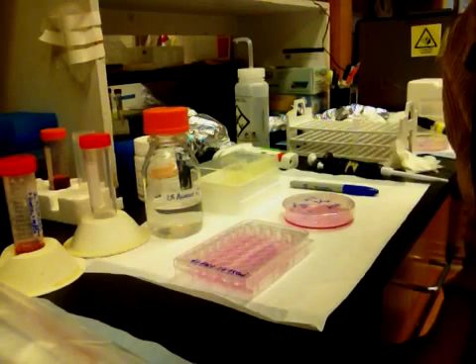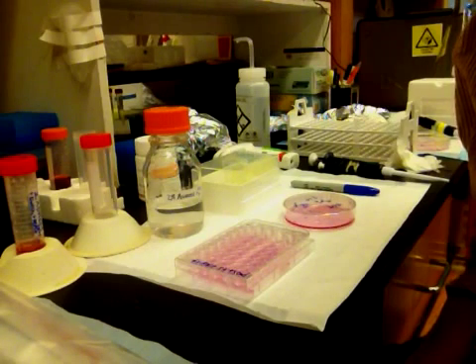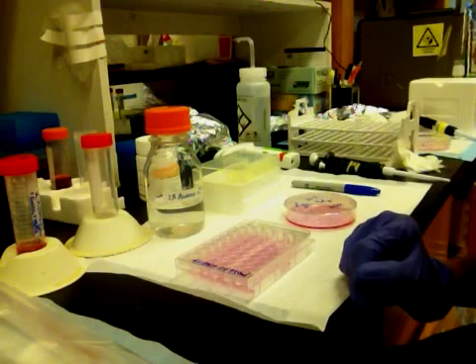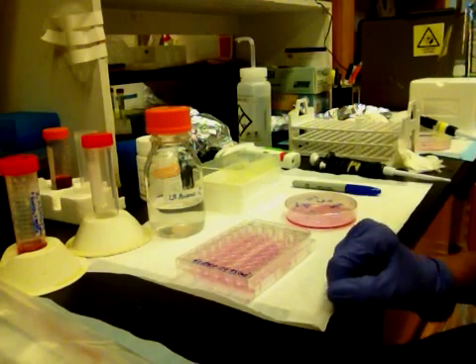Today we're going to clone cells using the agarose method. The advantage of this method is that you don't have to look at hundreds of plates for single clones, and you don't have to let your plates dry out because we're going to keep them moist with a layer of agarose.